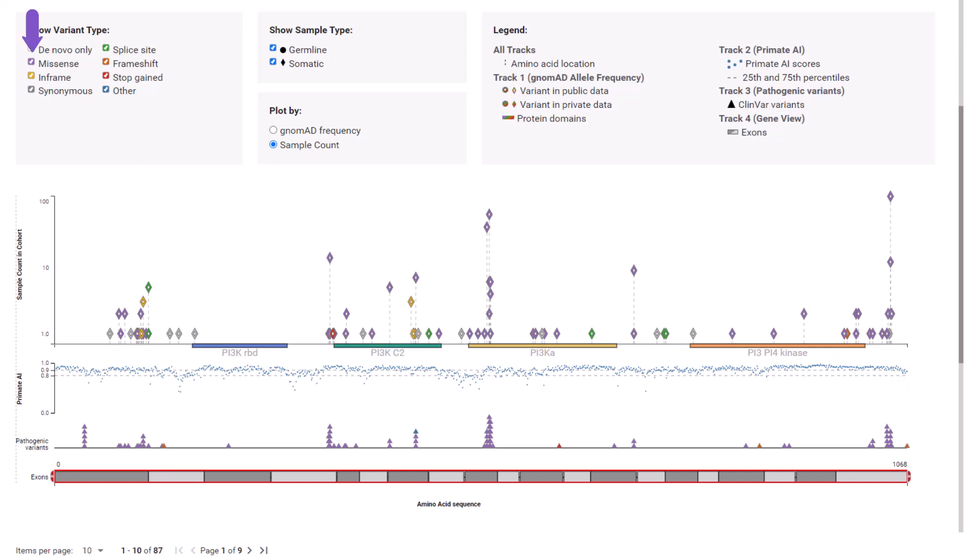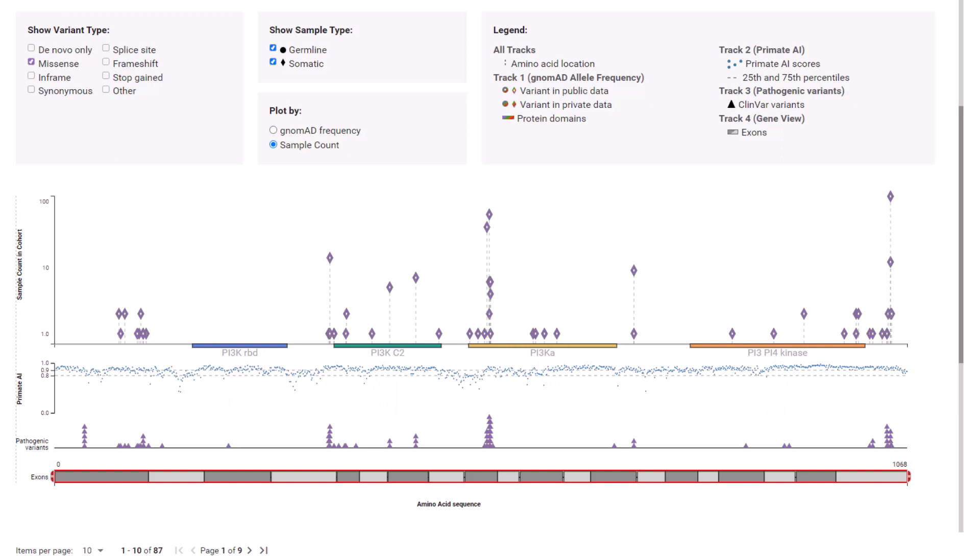We know that missense variants can severely disrupt translated protein activity. Deselect all variant types except for missense from the show variant type legend. As seen by the colored boxes and labels on the x-axis of the needle plot, many missense mutations are observed in the functional domains of the protein where biological activities have a high likelihood of detrimental impact.